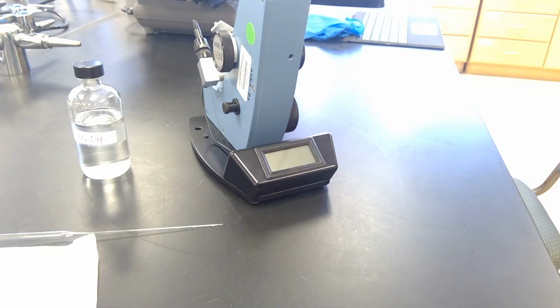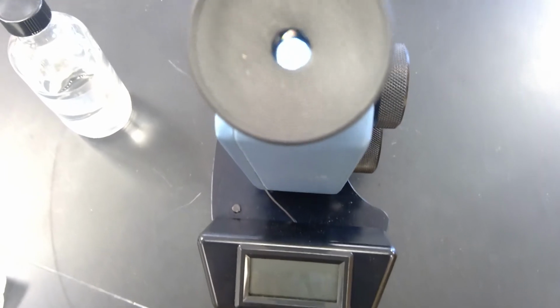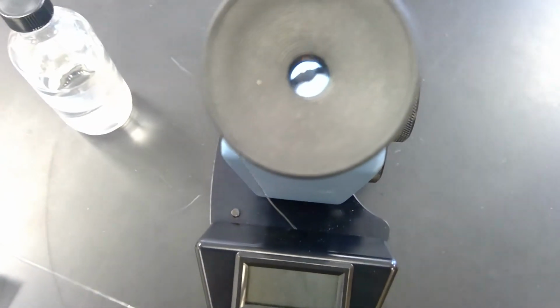Okay, so I have it adjusted. I'm going to try and bring you in to see if you guys can see the inside, but I doubt you can.